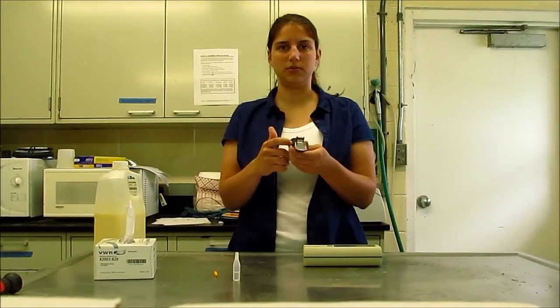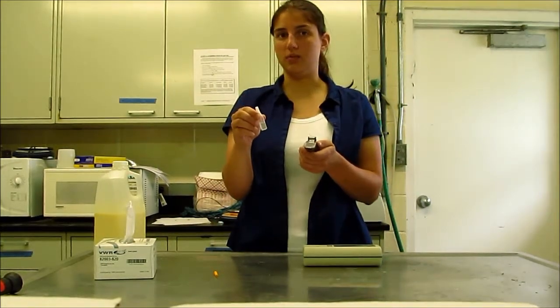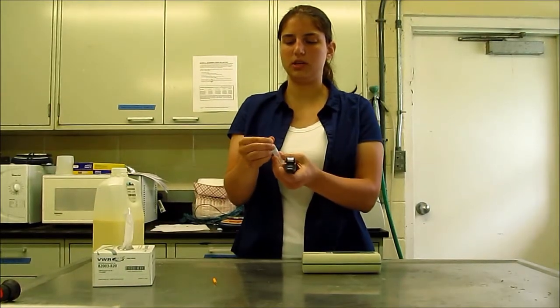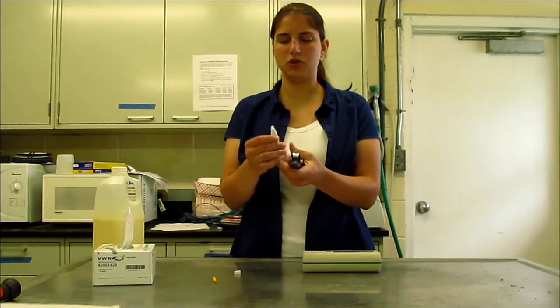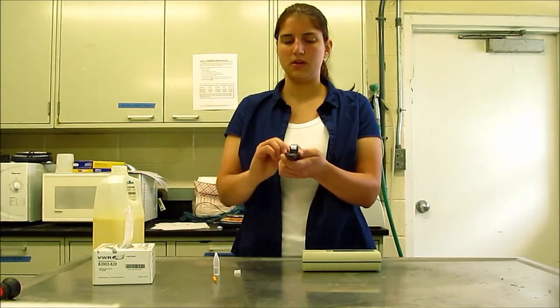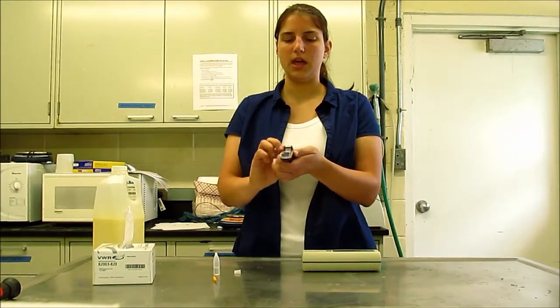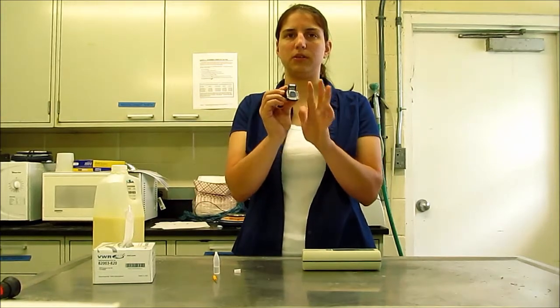In order to calibrate the refractometer, you will use some clean, clear water that should come with your refractometer. Very simply, you'll take the water and put just a few drops on the surface, flip the cover down to spread that out, and then look through the eyepiece at the scale at the bottom of the refractometer.